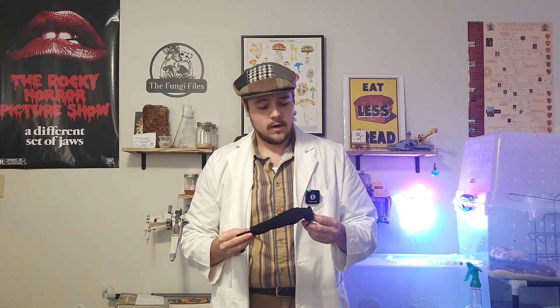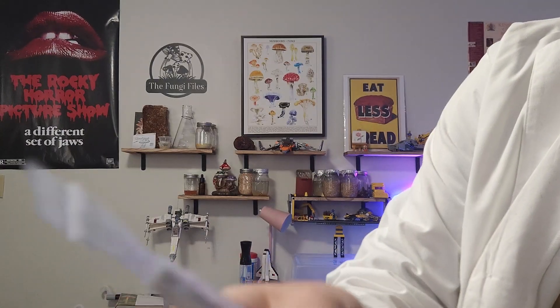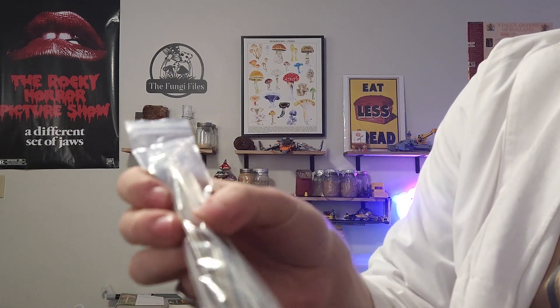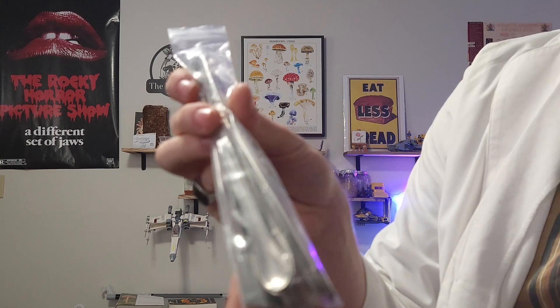Next for agar work I got this eight-dollar set of 13 agar tools. It comes with a nice little bag and includes scrapers that are flat — good for cutting — a large one for transferring good mycelium, and little scoops that I can use for measuring out nutrients.